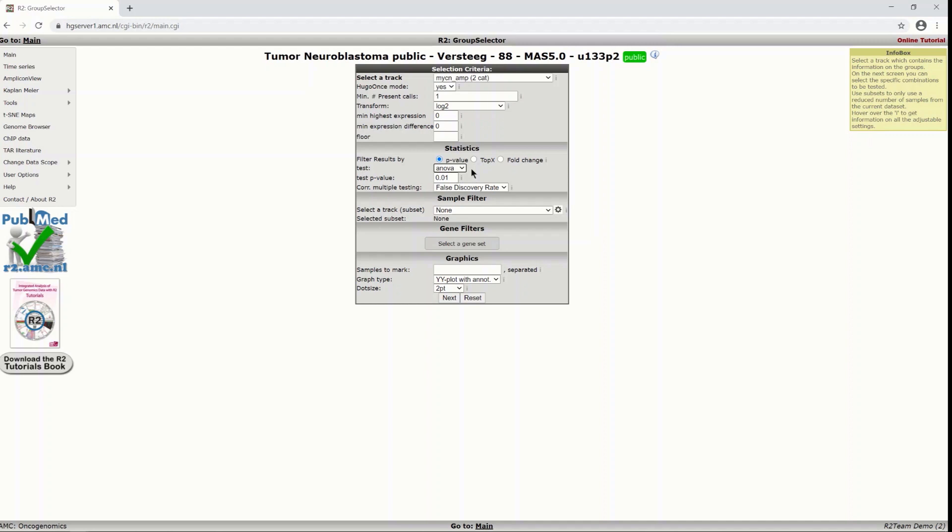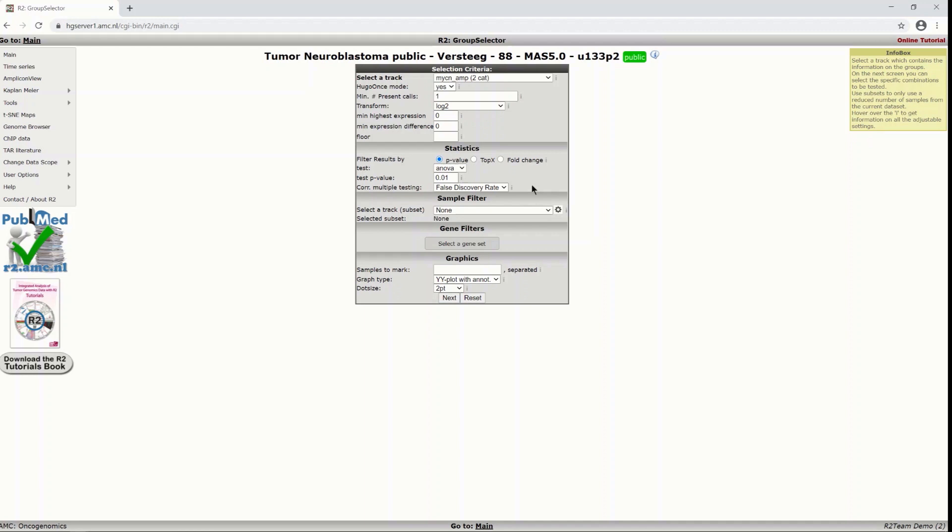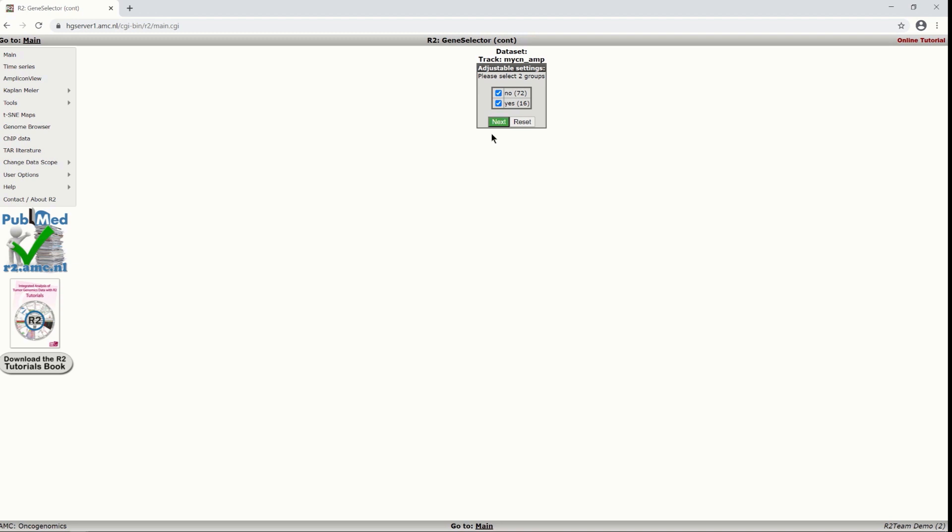Sometimes you might want to set the p-value a bit higher as a threshold or even if your sample size is really really small you might want to turn off the correction for multiple testing. But of course be careful with that and in our case that is certainly not helpful. So we stick with these settings and we just click next. We keep the selection of these two groups. So one group that has no MYCN amplification and one group that does have a MYCN amplification and we click next.